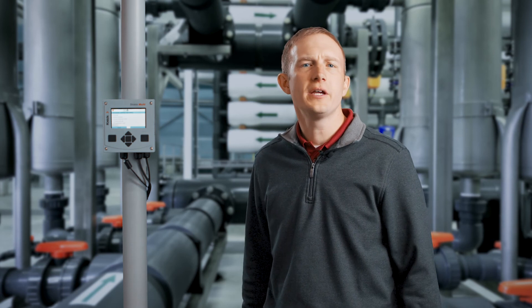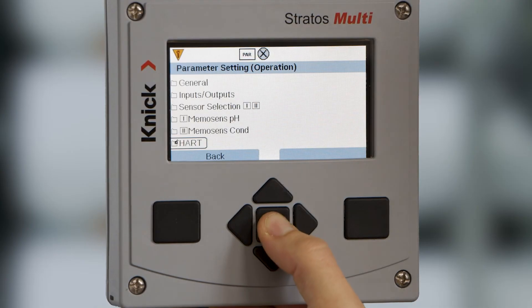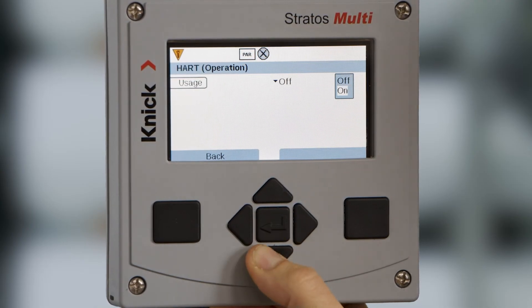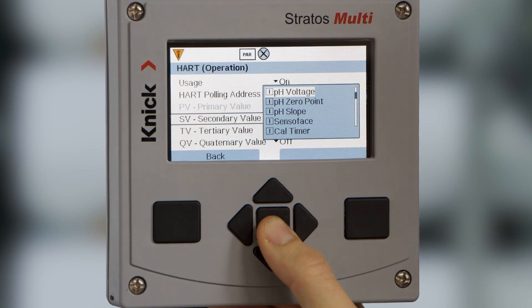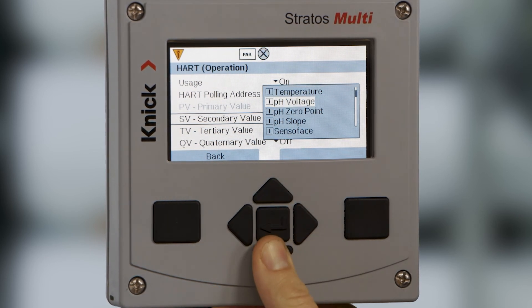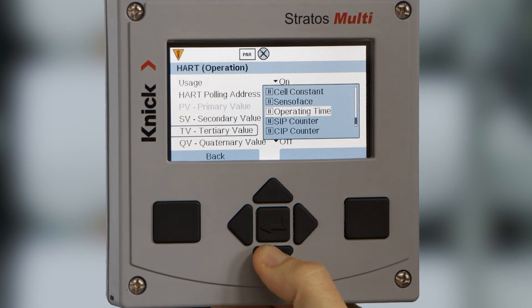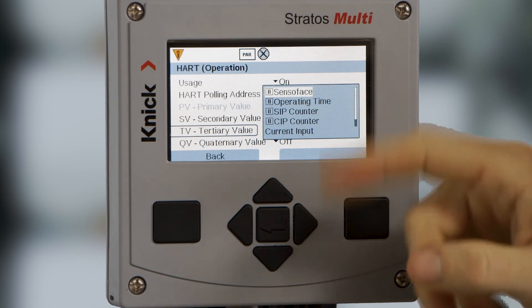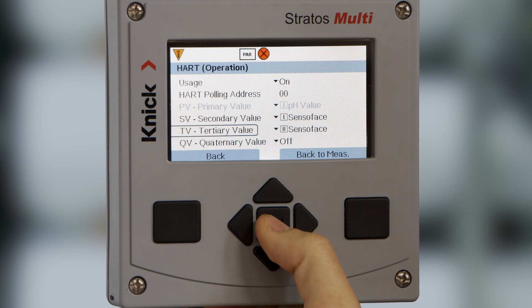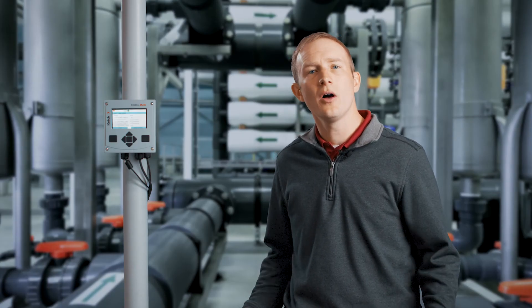The final step of configuring the Stratus multi-transmitter is setting up the HART communication protocol. If utilizing HART communication to your control system, you have the capability of not only selecting the main process values, but also the MemoSense diagnostic values. For our setup, we will enable the senso phase status for our pH and conductivity sensors on the second and third HART values. This will ensure continuous feedback to our control system on the health of our measurement loops.